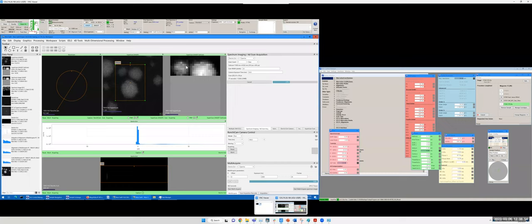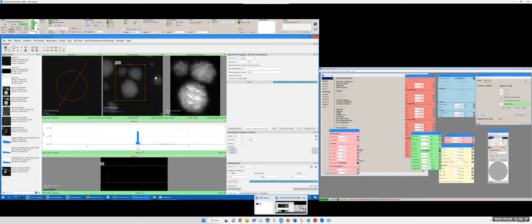Yeah, we are almost done. After doing this, I will quickly show you some monochromated EELS and then we're done for this part. You can take a rest and go on to the microscope for practice this afternoon. Okay, so yeah, I think you already practiced the data processing a little bit, but I can quickly show you, but not actually data processing. We still do a lot of processing using Digital Micrograph.